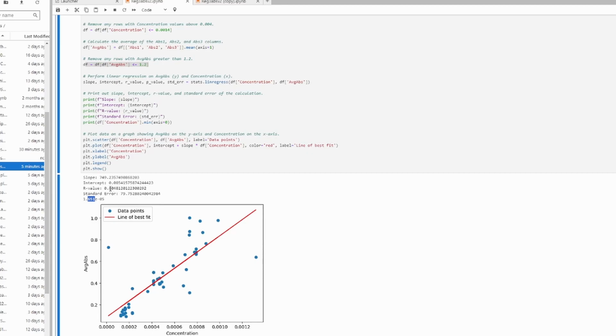So we see we got an R value of 0.80 currently. We're going to try to remove this value, which appears to be this one right here, because we defined the minimum of the concentration. It spit out this right here. And this definitely seems to be an error. There's no concentration that should be this low. Again, this is 10 times lower than anything anyone has done. And so it's clear that there was an error in the calculation, and this probably should have been up here in part of the 5 milliliter volumetric standards.